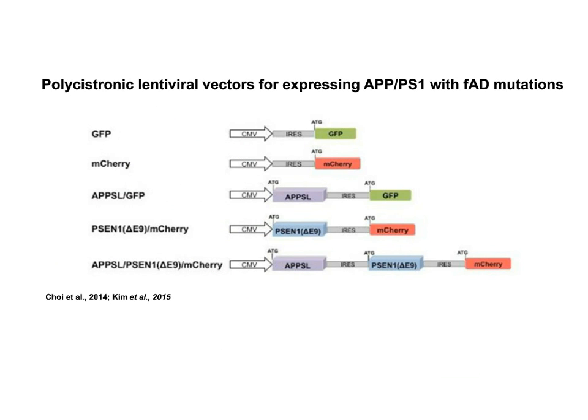Okay, this is the diagram showing the lentiviral vector. This is a polycistronic vector, in which you can see the IRES system. The nice thing about this is that, for example, APP in the middle, the APP Swedish and London mutation, is linked to GFP. So we are de facto sorting cells expressing high levels of GFP. That means we are selecting cells with high levels of APP with mutations. And same thing for presenilin, and we can even make it combined together.